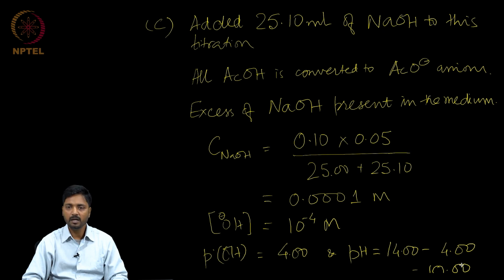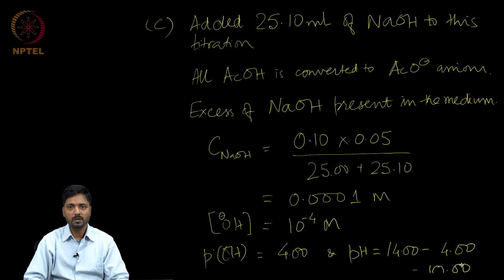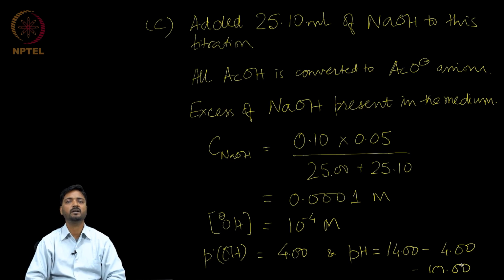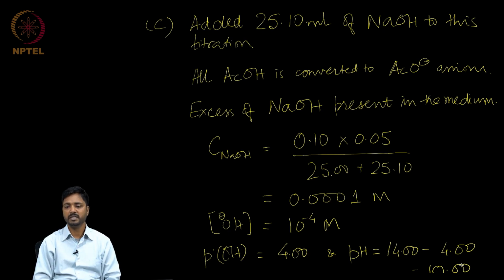So, we have seen how a variety of volumetric titrations or pH metric titrations are undertaken. Now, in the rest of this week, we will be focusing on how we can use gravimetric titrations for our analysis, and we will understand what the principles involved in gravimetric titrations are.